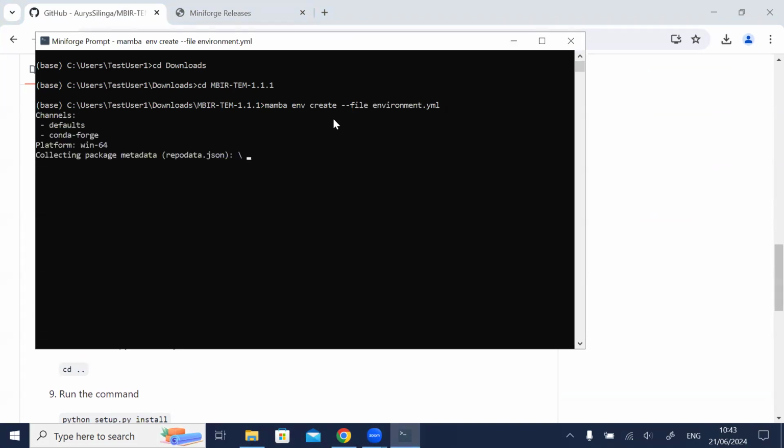This will parse the list of required packages for the software to run and download the most appropriate version of each one automatically. But it will take a while. Feel free to skip ahead. I will still include this in the video for completeness.